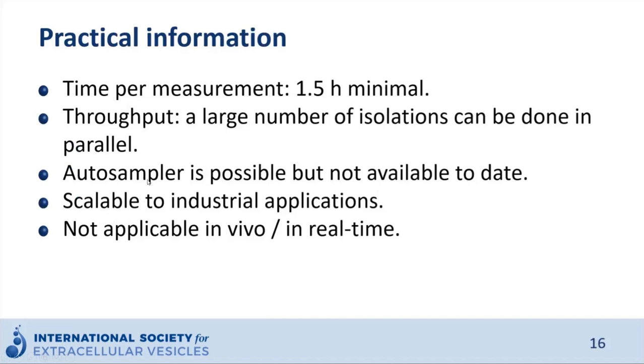Although currently an autosampler seems not to be commercially available, it is promising that we can expect that. And the PEG method can be easily scaled up for industrial applications. But when we perform in vivo analysis or pursue real-time monitoring, the PEG method seems not to be applicable.